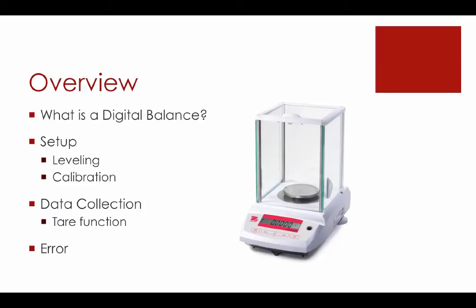We'll talk about the proper way to set up a digital balance. This involves leveling the balance and also the process of calibrating the balance so that it gives accurate readings. We'll then talk about the actual process of data collection, how to use the digital balance, specifically focusing on the tear function. And finally, we'll start talking about how the balance can introduce error into your experiment, something you can use as a discussion point for your lab reports.